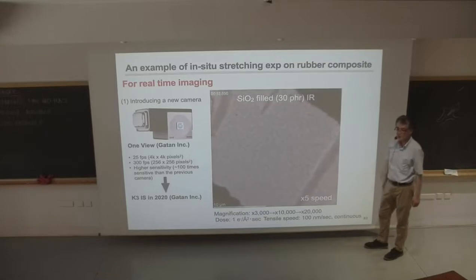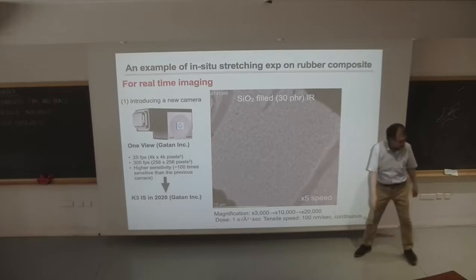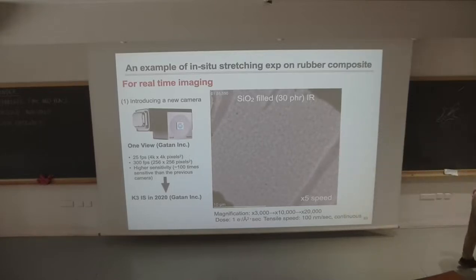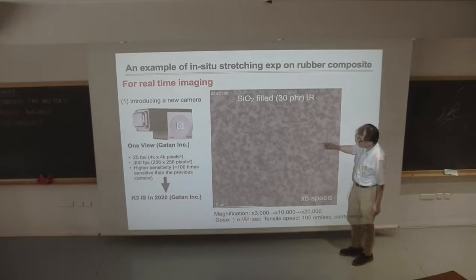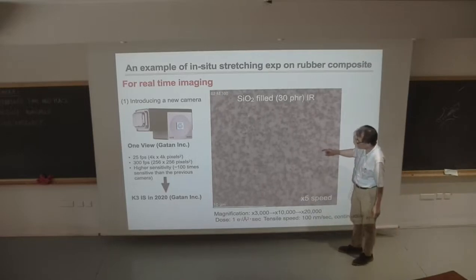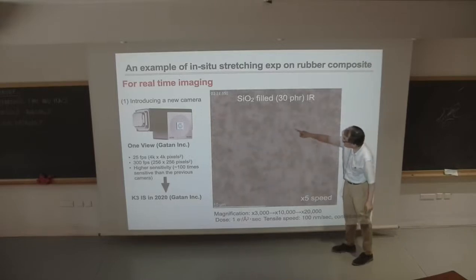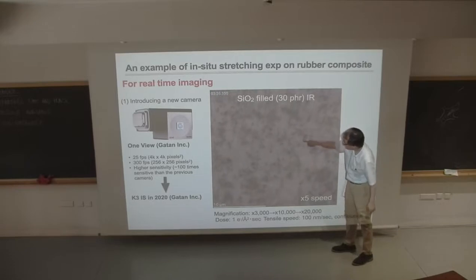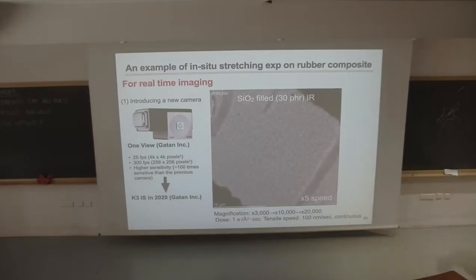And then the sample has been destroyed, somewhere not in the field of view. Somewhere, it's being cut. So the important thing is that towards the end, there are very bright places. They look like white. See, like this. There are white places. Those are the nano cavities.